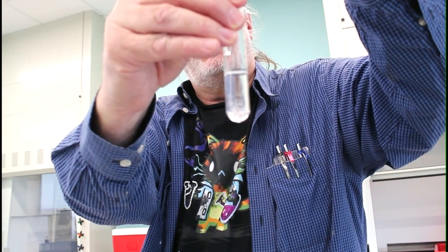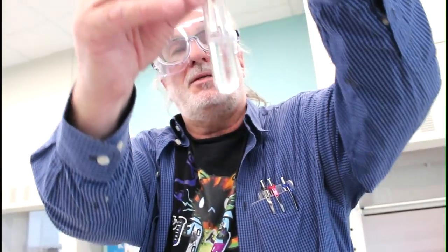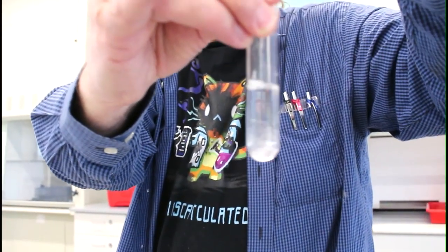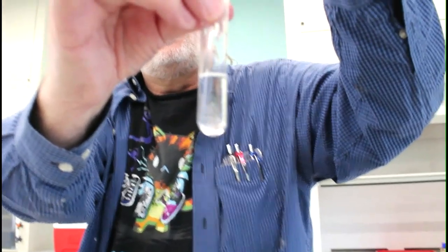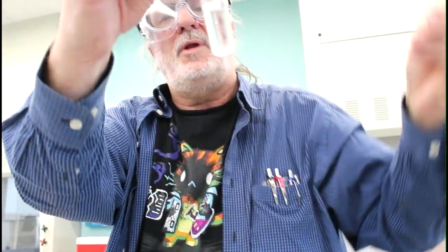Nice. You still got some particulates, but a lot less than before. Can you tell the amount of the solid if I stir it? A lot less. That's cool. A lot less than it was before. Yeah, I wonder what would happen if I added some more.